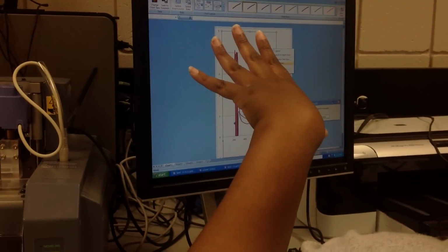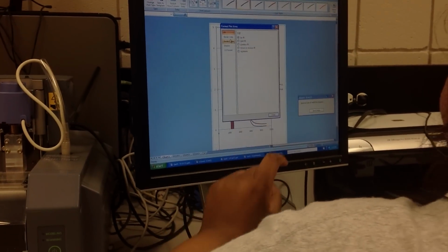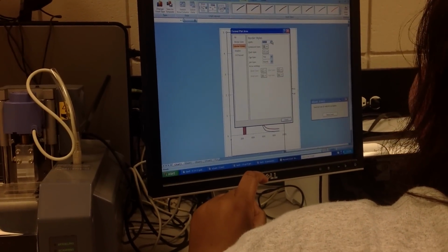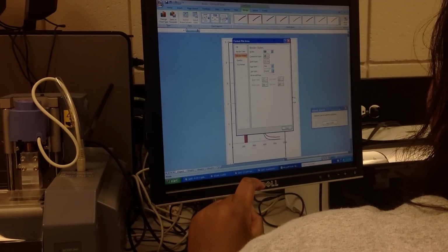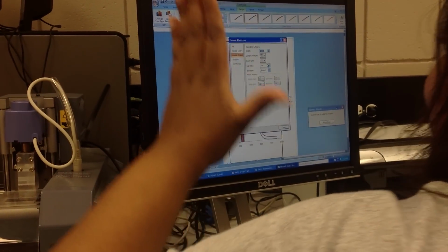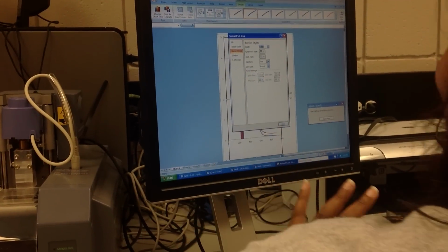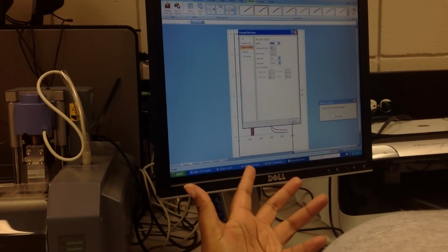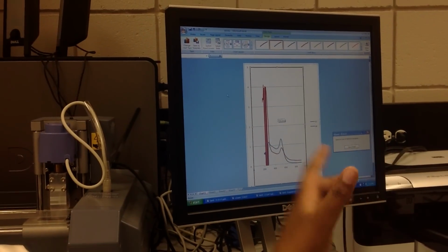And so this probably needs to be thickened up a little bit. So what I want you to do, under styles, thicken this up to about 2, maybe 2.5. Because what we want to do is make it really big and nice, so when you shrink it down and put it in your thesis or your paper, it's readable, nicely formatted already, and they're going to be consistent.